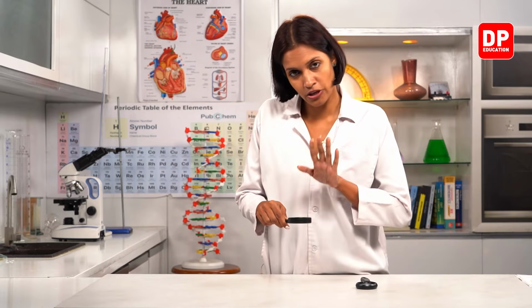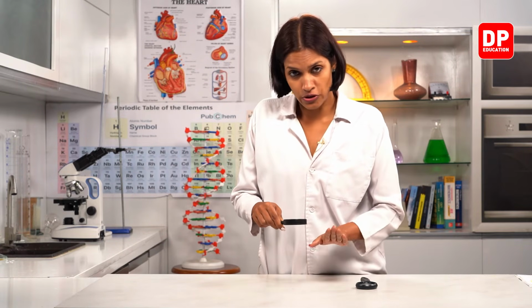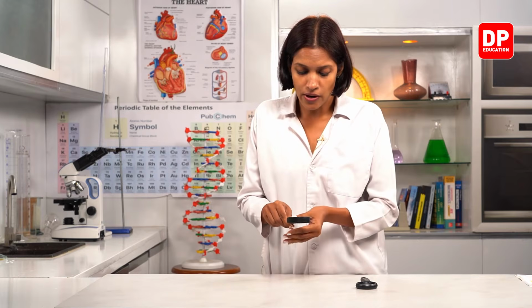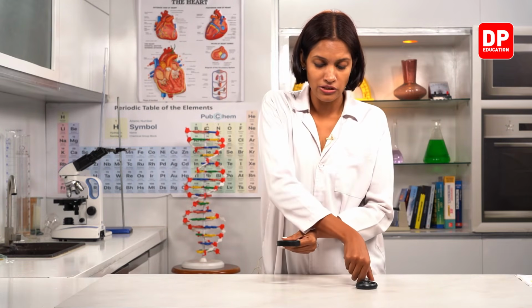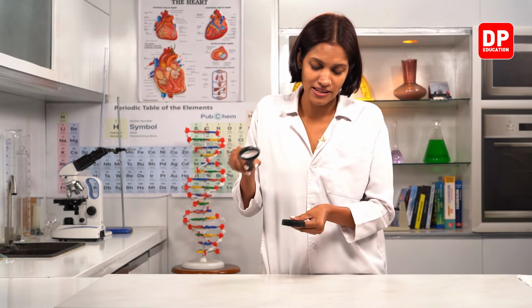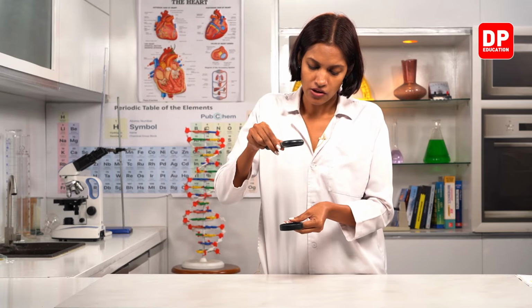So which means when we use one hand lens, the resolving power and the magnification increase compared to the naked eye. Now what I am going to do is hold the second hand lens above the first hand lens. Let's see what happens now. Right. Observe very carefully.